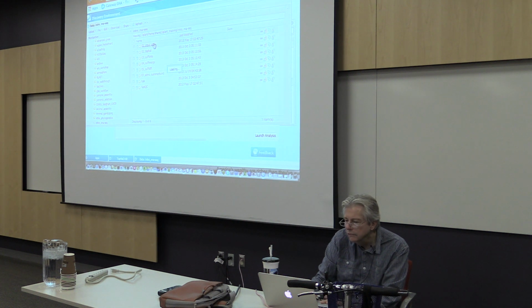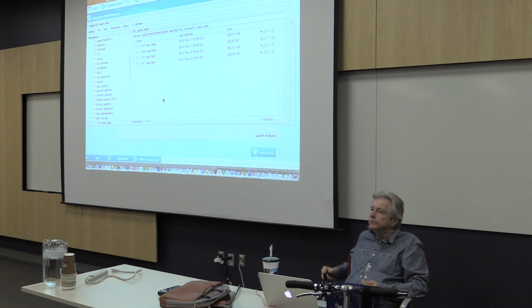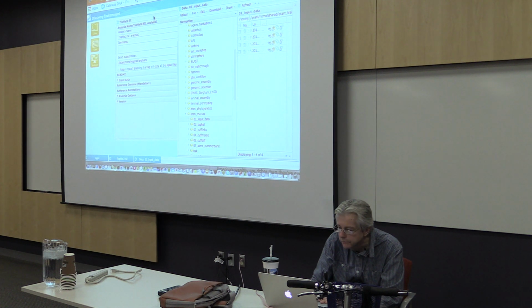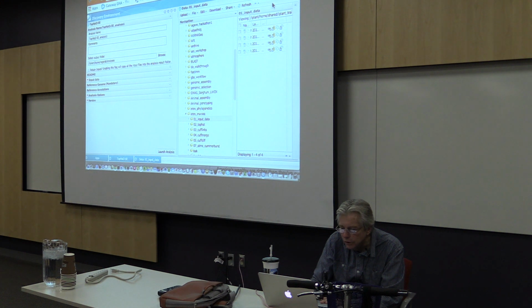And input data, number 1. Those are the read files that we were talking about. Those are the files that we can put, and we learned this, I learned this last week too, that you can click on this little symbol, whatever it is, and separate your boxes.